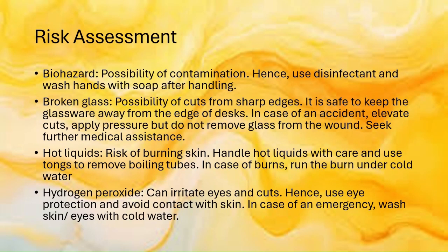So what are the different risk assessments? So you need to acknowledge the biohazard, which is the green peas. So possibility of contamination can take place. So use disinfectant and wash hands with soap after handling.